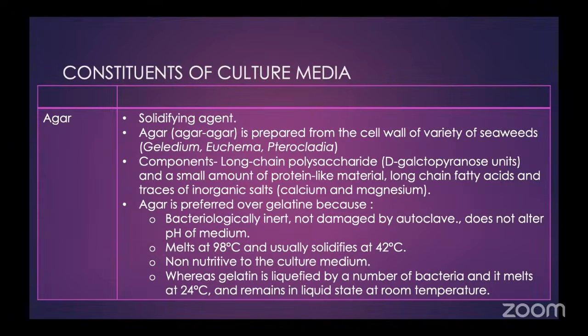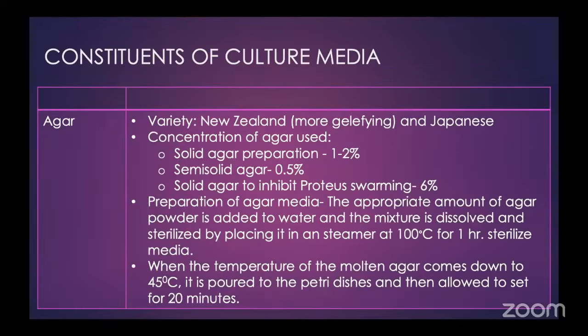So you know the nutritional requirement of bacteria when you are checking for research or any other purposes. You know that agar is not adding any nutrition. The problem with gelatin is that it gets liquefied by a number of bacteria and it melts at 24 degrees and remains liquid at room temperature. So, as I said, it has to be refrigerated before you go ahead.